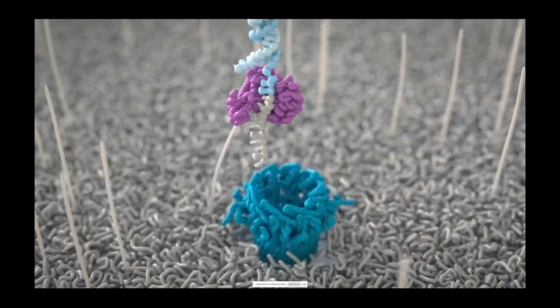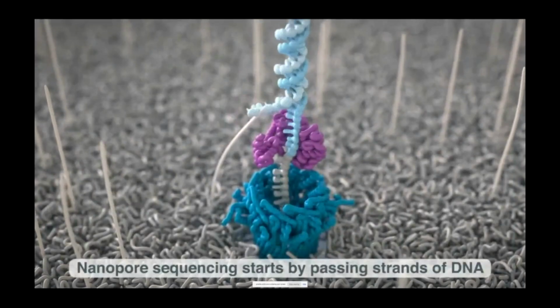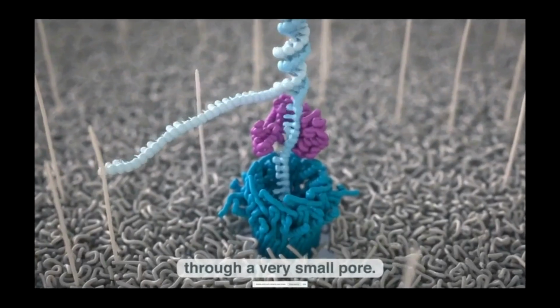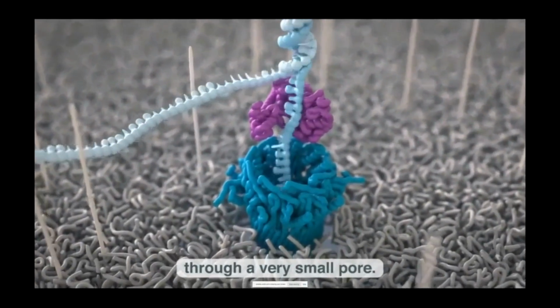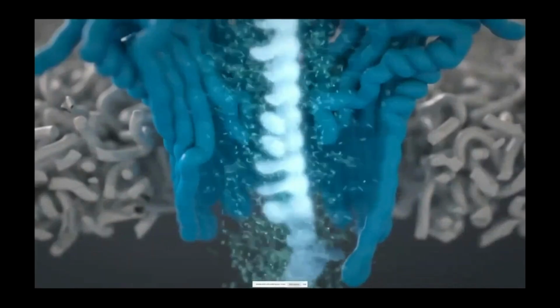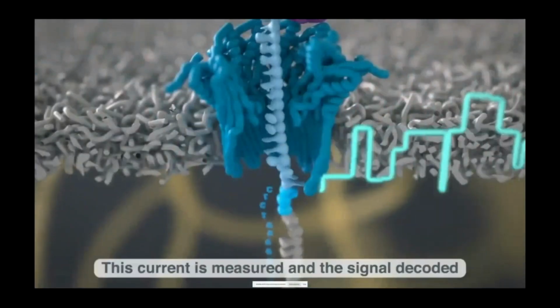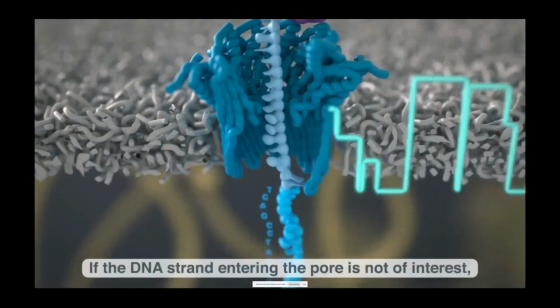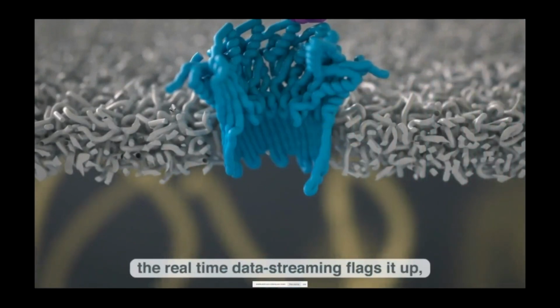So we've already had a bit of an overview of nanopore sequencing and how it works. This video shows a molecule being captured by a nanopore being sequenced. And one of the remarkable things that you can do with nanopore sequencing is you can actually work in real time with those data, and you can select the molecules that you want to sequence.